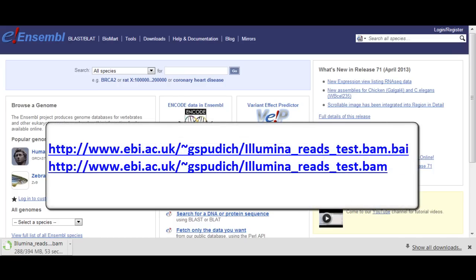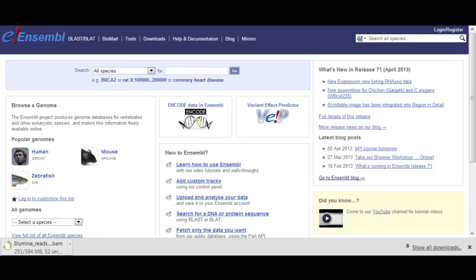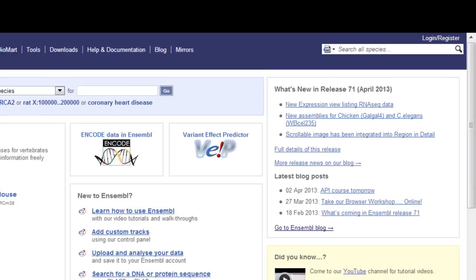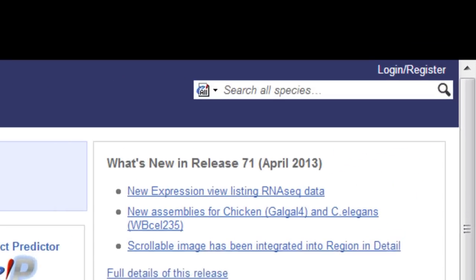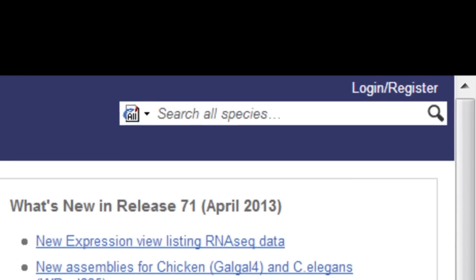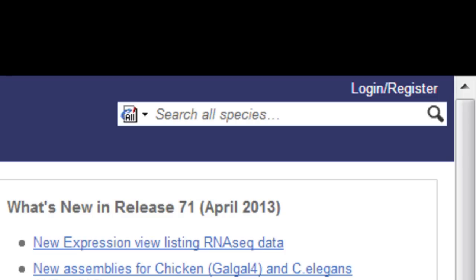First I'm going to navigate to chromosome 20. I'm especially interested in the CDH22 gene, so I'll navigate to the location tab for that gene in human. You don't have to log in, but I'm going to because that way I can save my data to my account.